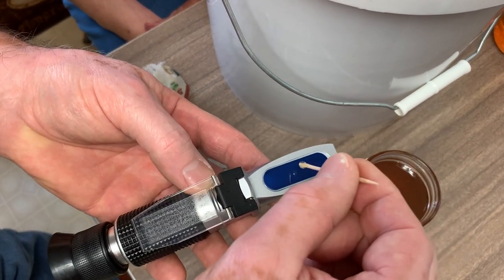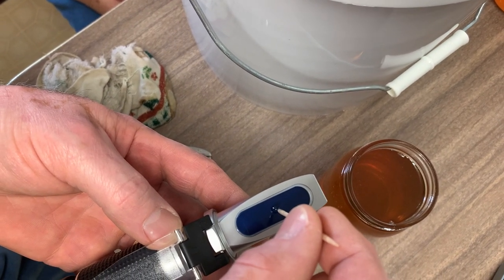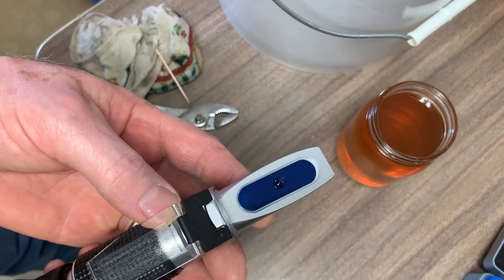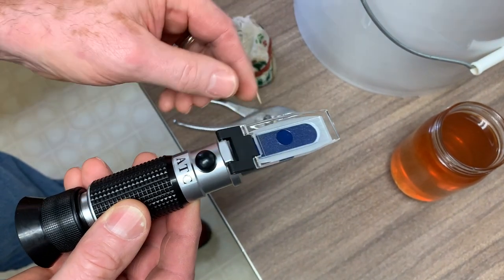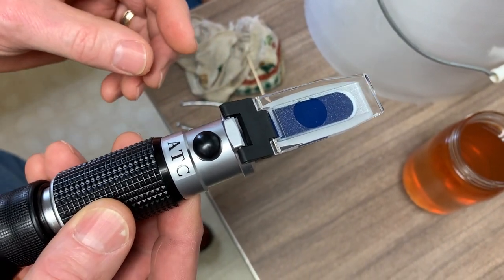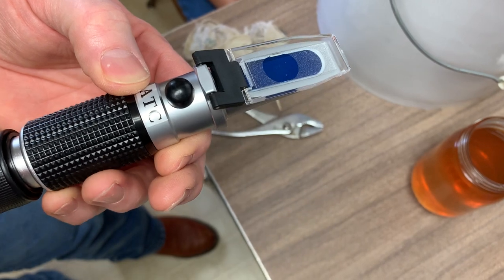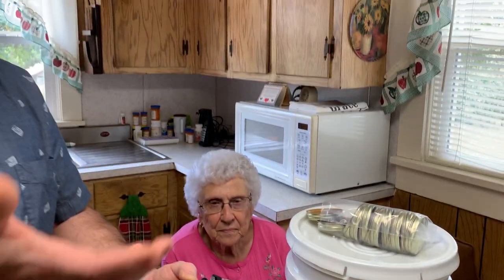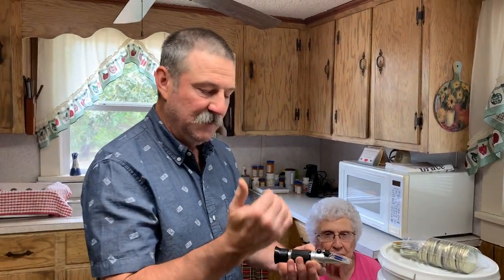Okay, so we load a droplet of honey onto the slide. You try to do it without foam and without interference from anything else, such as breath or moisture content in the air. We close down our slide. You see it on the prism. Now it's made a circle. It's thinned that out. What we're doing now is looking into the refractometer in ambient light, and it is going to refract the water from solid honey and pick up the water refraction that's in that honey and separate that in the finder.